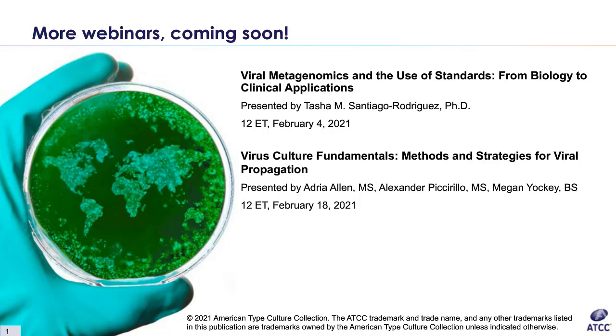I mean, one of the things with that is that you're going to be adding the XTT reagent to all of the wells in that particular experiment, right? So even the control wells are getting the same thing. Presumably, it would have the same effect across the board. But that's just me taking a stab at it.